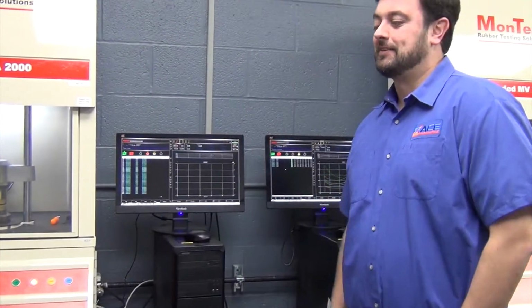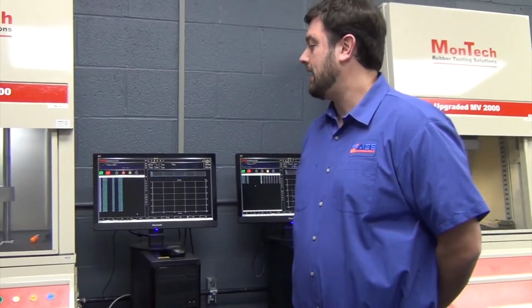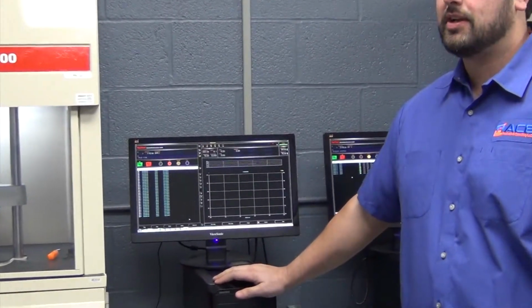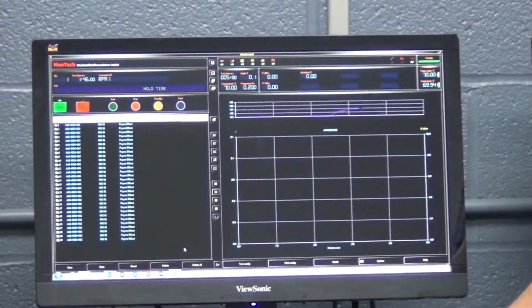Some of the standard tests we run on this would be ASTM 6204 and ASTM 6601, but as Erick said, it's highly customizable. We've really worked to identify those tests that are in demand.